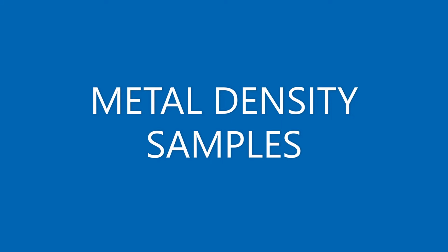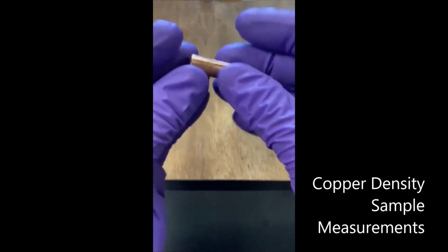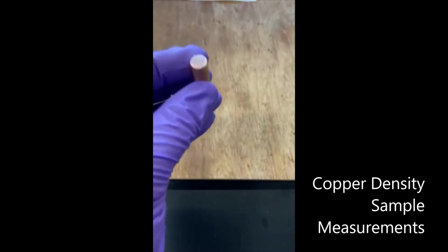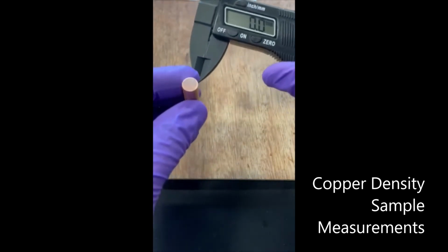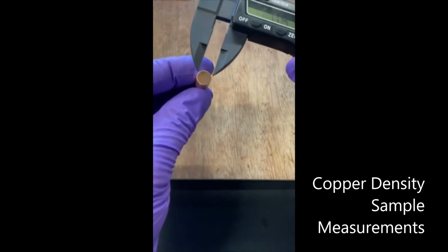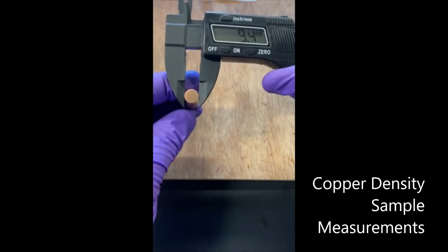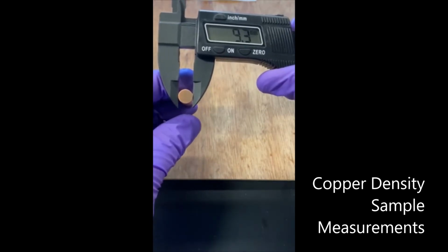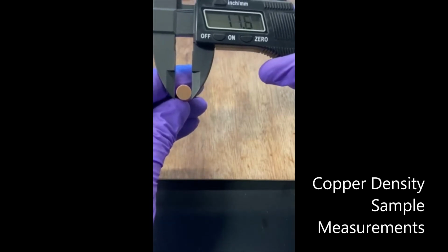Next, we will make dimensional measurements for the metal cylindrical samples, from which we will calculate the density of these materials, measuring the mass and the volume of each cylinder. The metal density samples are all right regular cylinders, and we'll start by showing you the measurement of the cylinder diameter, and then its length, and then the mass for each sample. We will use the copper cylinder as the first demonstration.